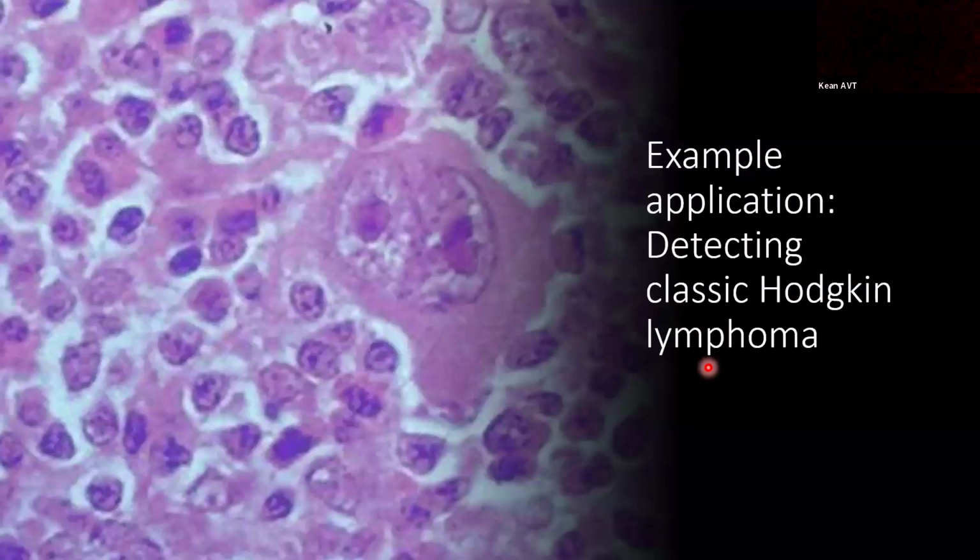Okay, so one of the first forays into using supervised machine learning for me was actually applying it to classic Hodgkin lymphoma. So we had a panel that it's not used very often in clinical laboratories, and it kind of takes some training for new hematopathologists to be able to interpret the data. So we were thinking, well, what if we had a machine learning classifier that could look at the data and say yes or no, and maybe that could help new hematopathologists who might be trying to interpret the data.